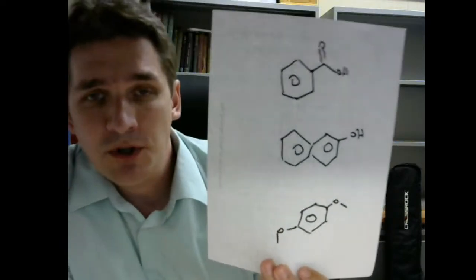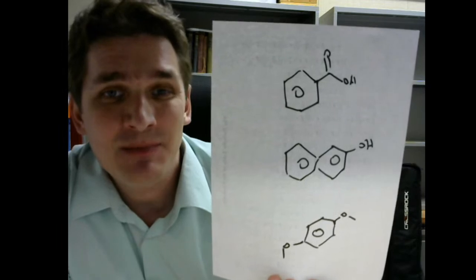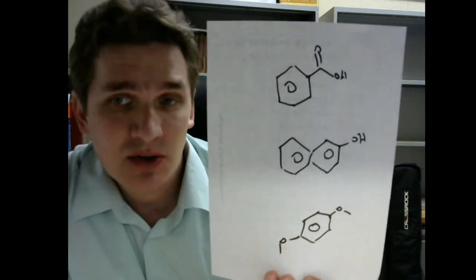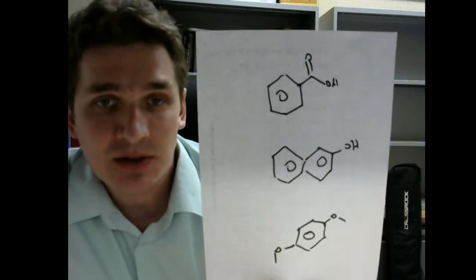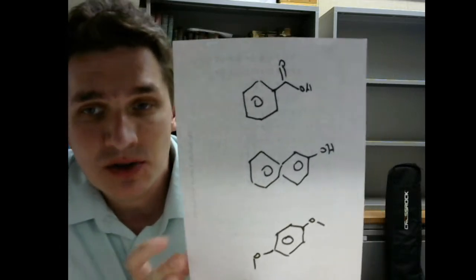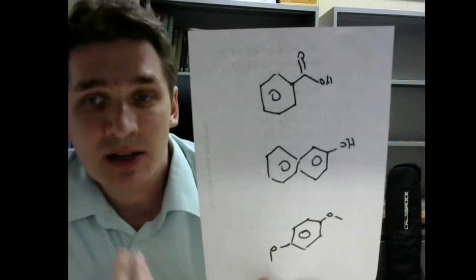Now, we're going to use process of elimination to figure out where they're going to go because we have solutions A, B, and C. C is the organic layer. Well, one of these doesn't react. Two of these act as acids or bases. The third does not do anything at all. So the para-dimethoxybenzene does not react with any of the reagents. It stays as a covalent compound. So your para-dimethoxybenzene here is going to end up in your organic phase when you're done.